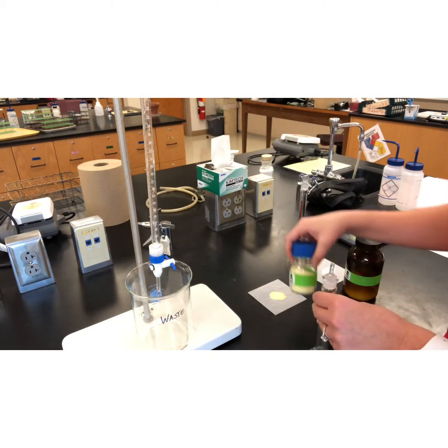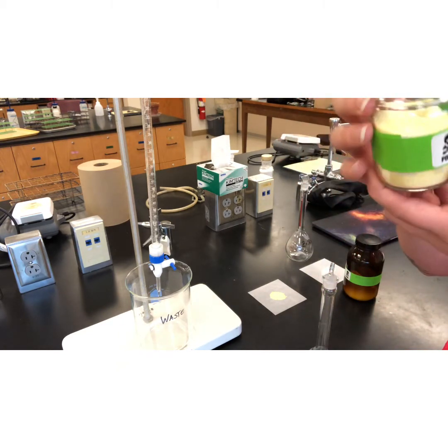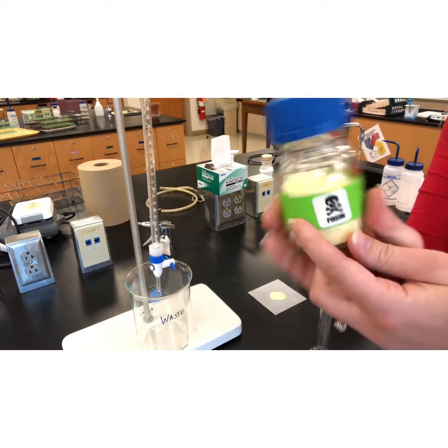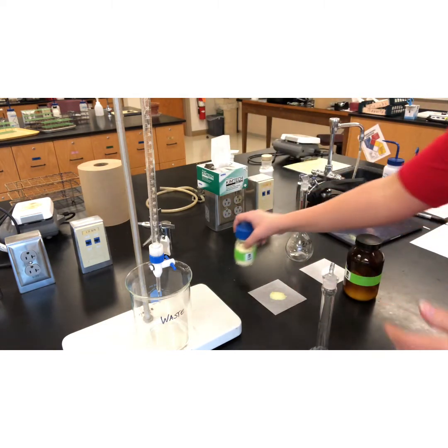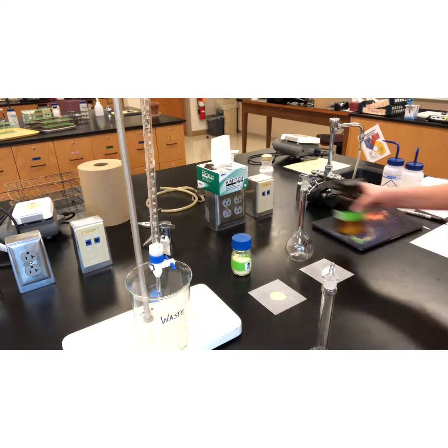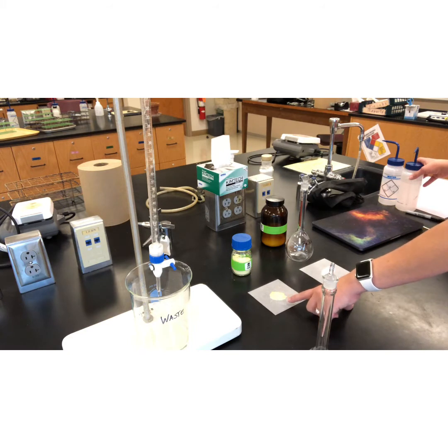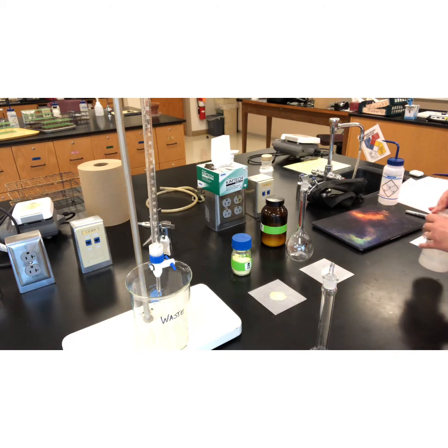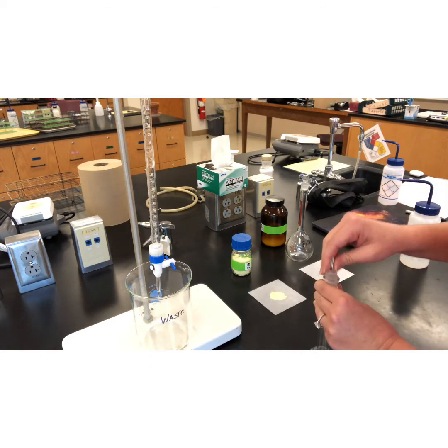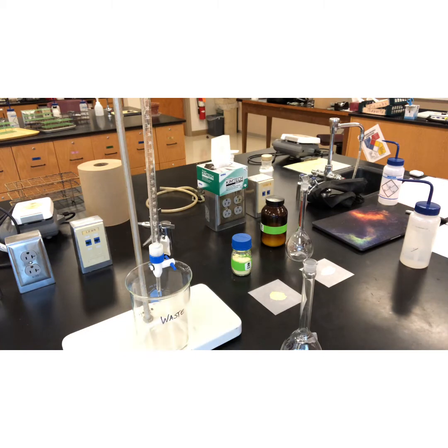So let's get started with the process. Here is the potassium ferrocyanide trihydrate. It's kind of a pretty little yellow crystal. I've got both of my masses weighed out for my potassium ferrocyanide and my zinc sulfate dihydrate. I forgot to grab something, so I'm going to pause it and go get what I need.